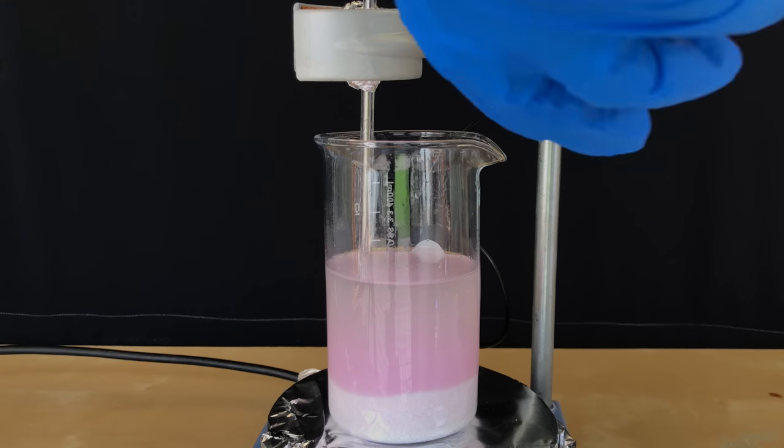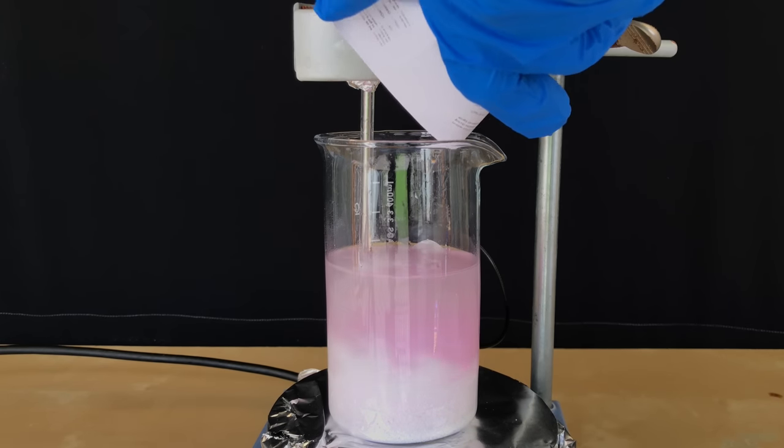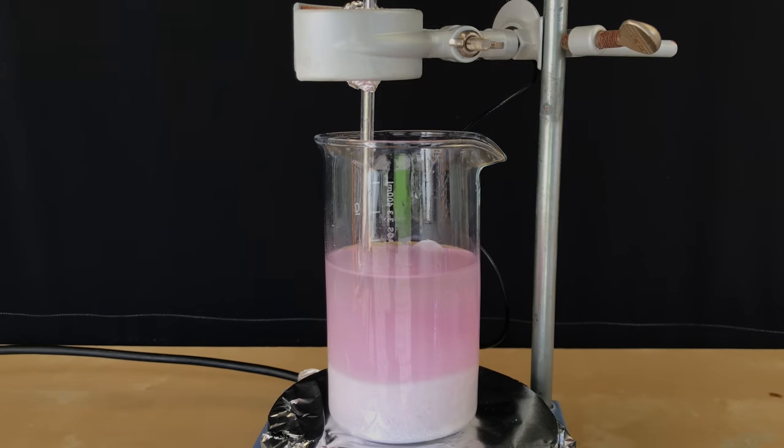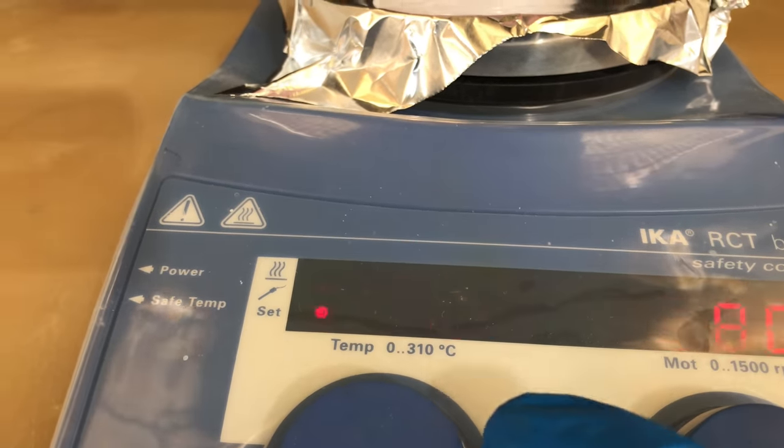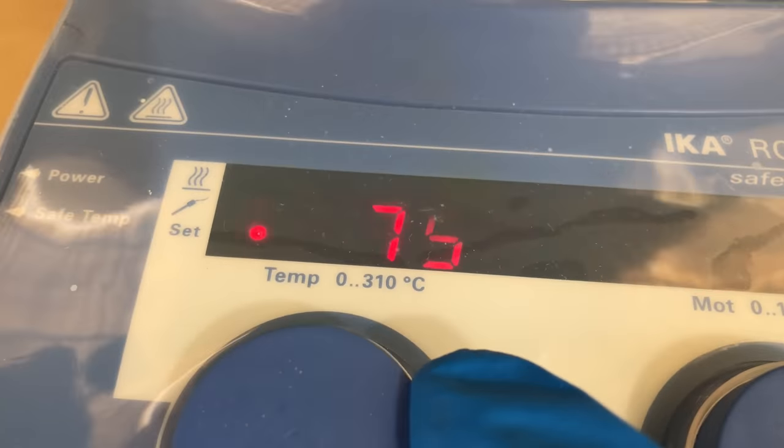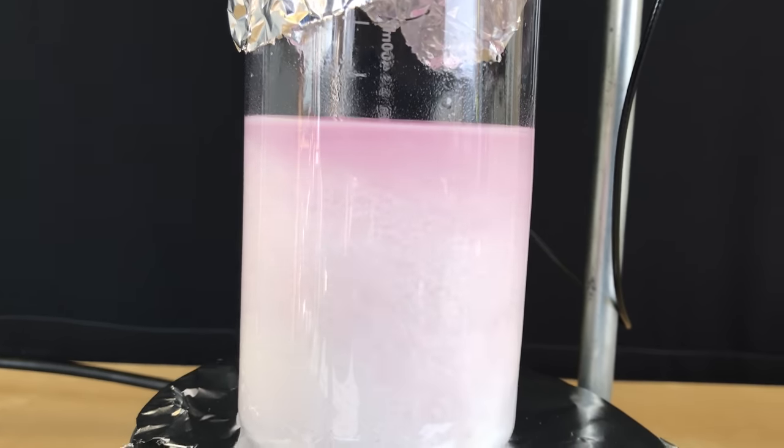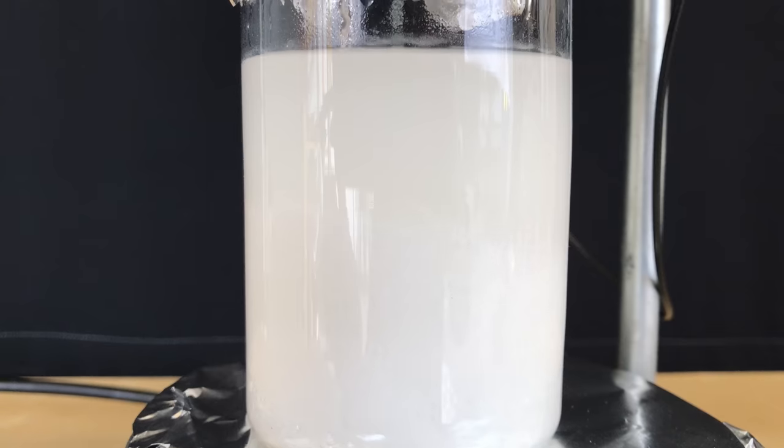For whatever unexpected reason, the solution turned pink after adding the carbonate. If you know why, I'd be pleased if you write a comment. To monitor and control the temperature, an electric thermocouple was inserted into the beaker. We needed to maintain the temperature between 75 and 80 degrees Celsius for 90 minutes under heavy stirring.